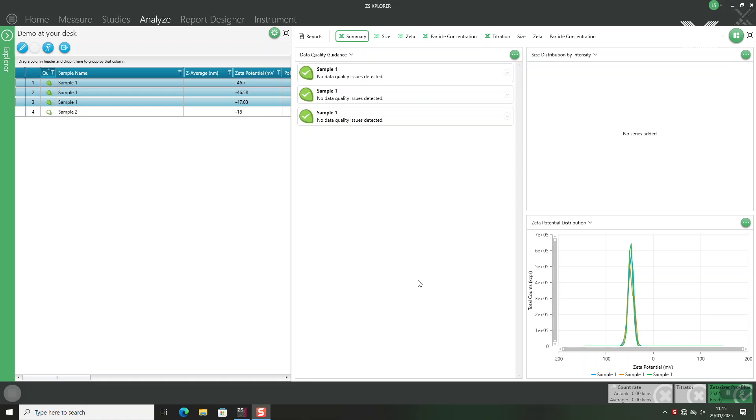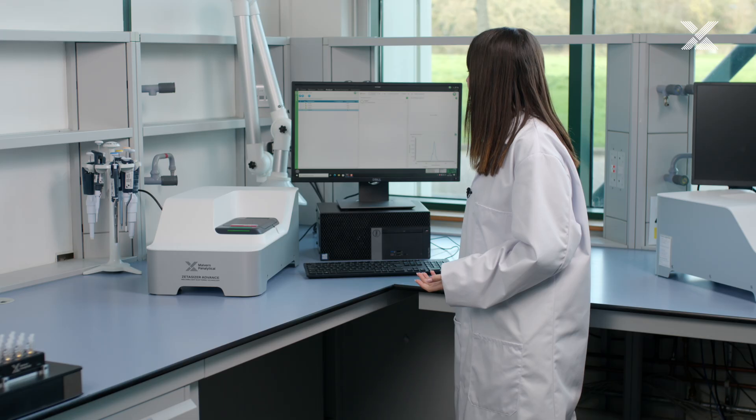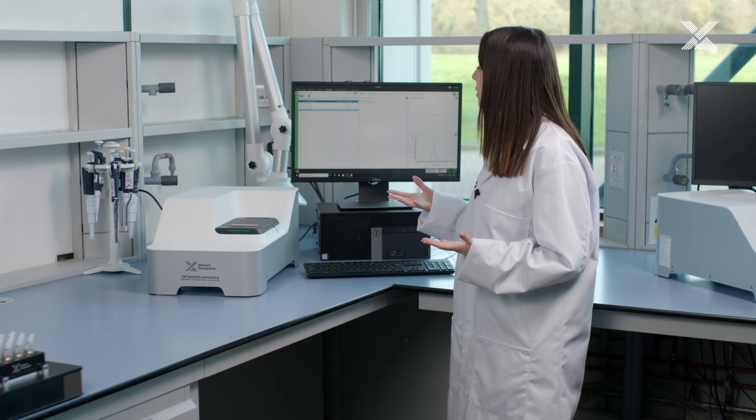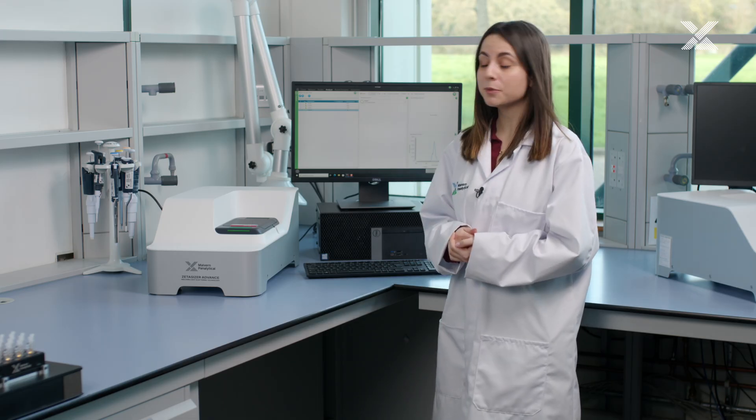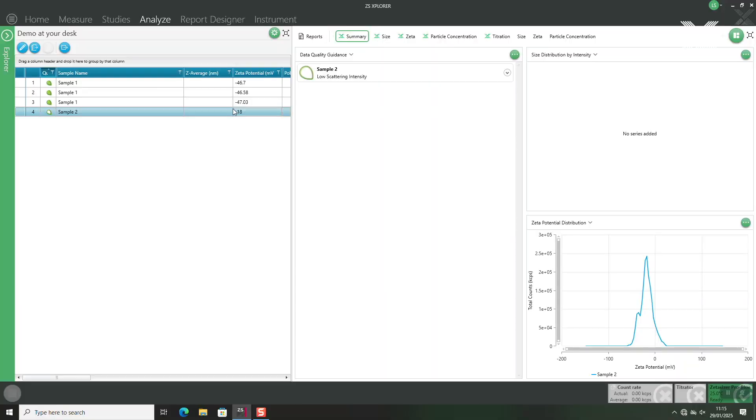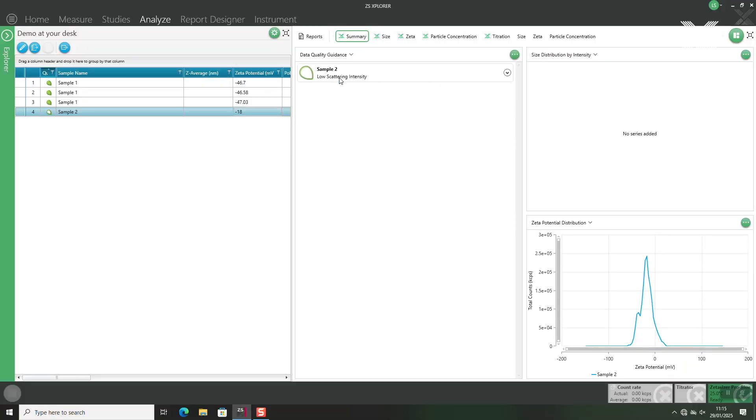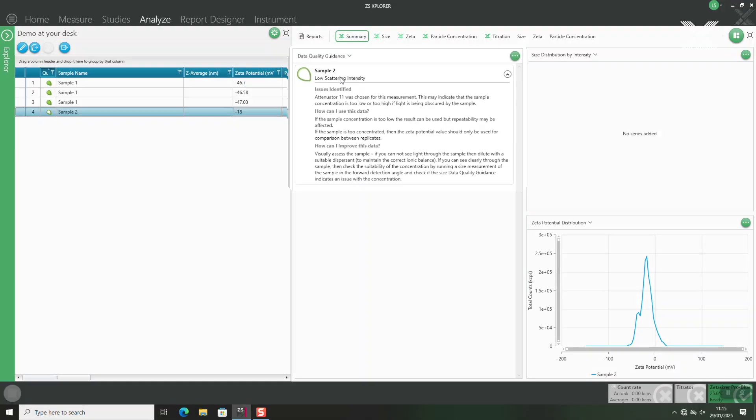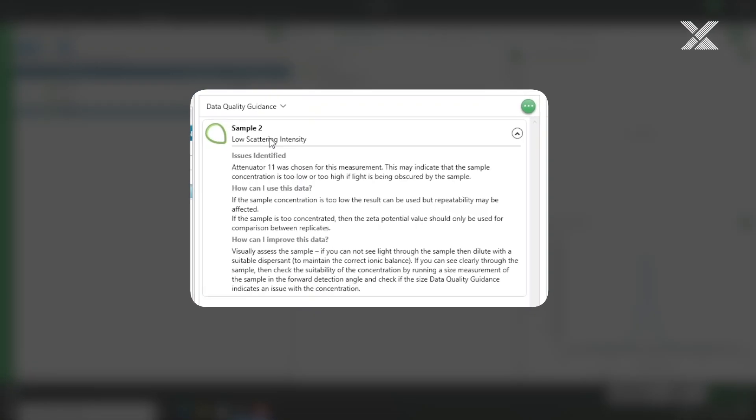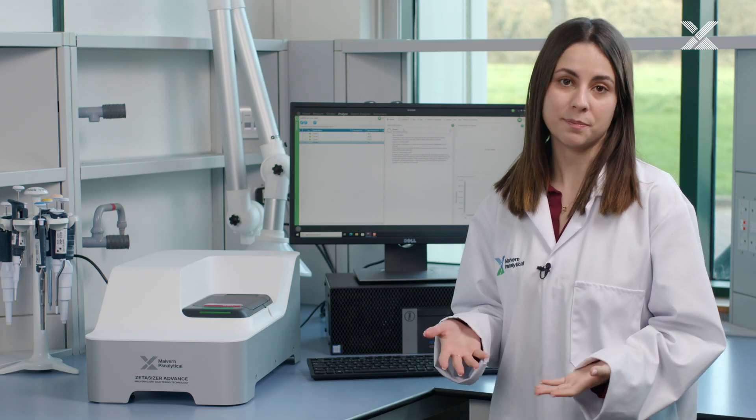As an example if there was something going on with our samples the data quality guidance will flag it up. In this scenario there was low scattering intensity meaning we probably need to increase the concentration of our particles and then redo the measurement.